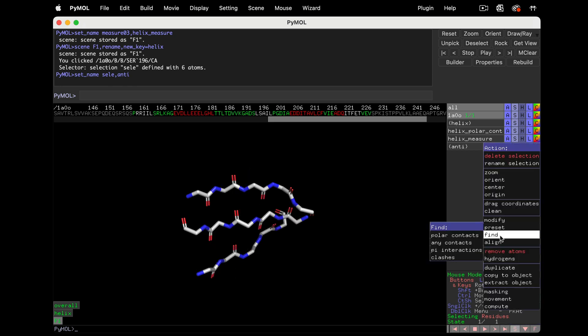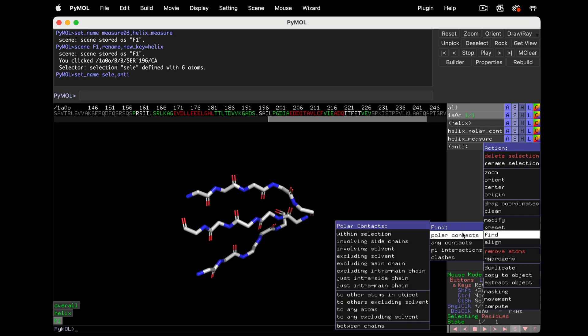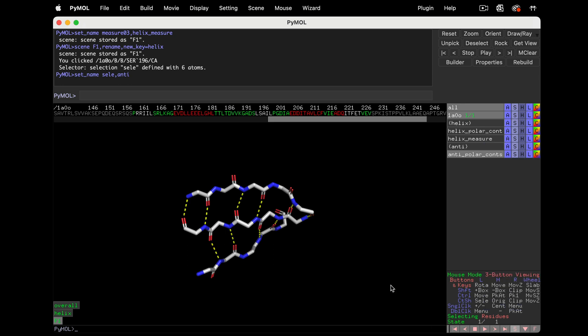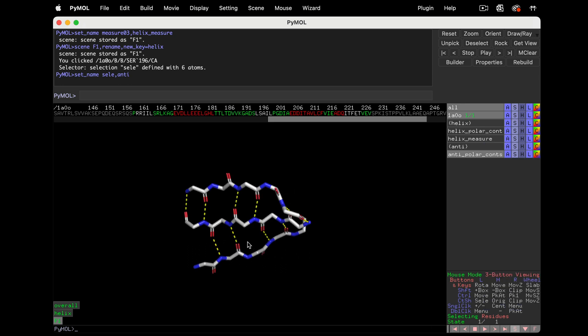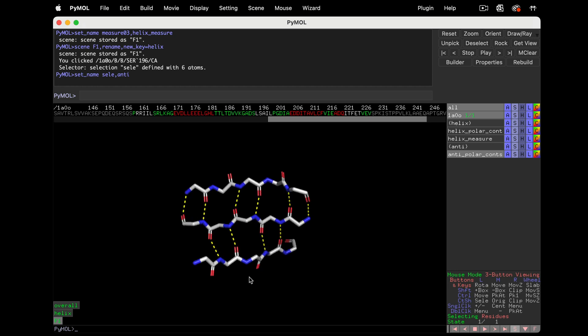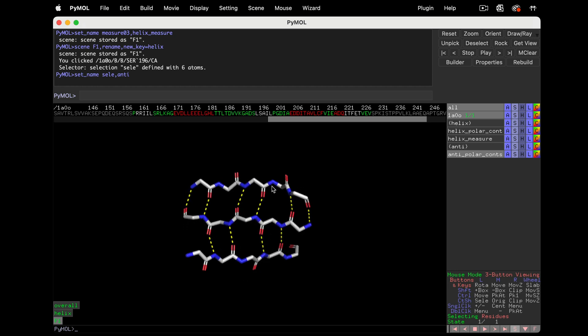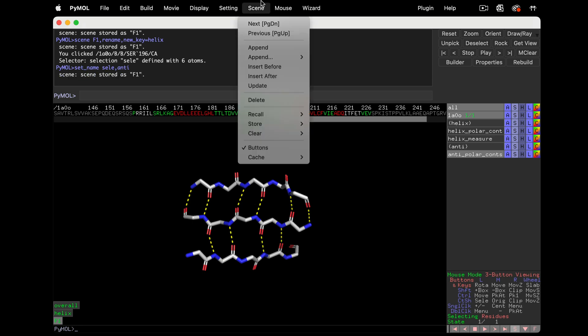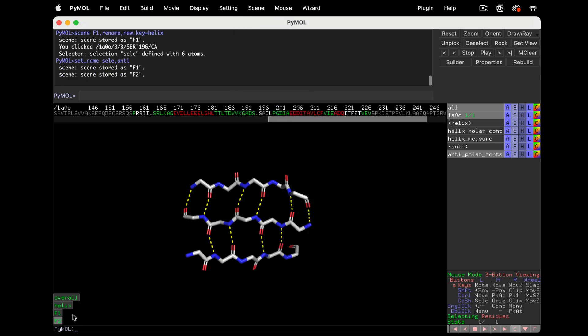Notice where the side chains are relative to the backbone atoms. Then hide the side chains and the cartoon. Now find polar contacts, just intra main chain. There they are. Notice again these are between a carbonyl oxygen and the NH of the backbone nitrogen. We don't see the interacting hydrogen atoms. Go ahead and save a scene.